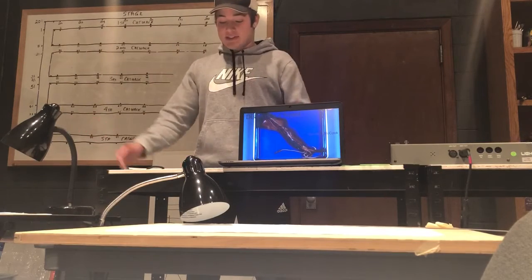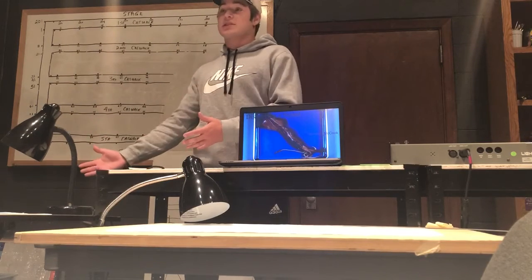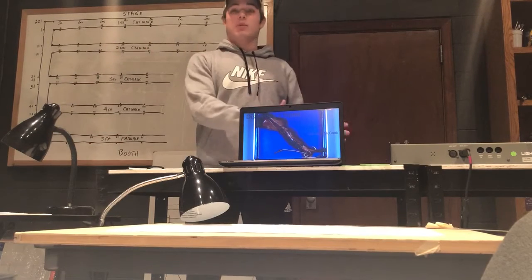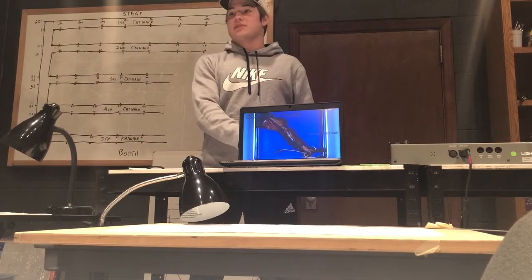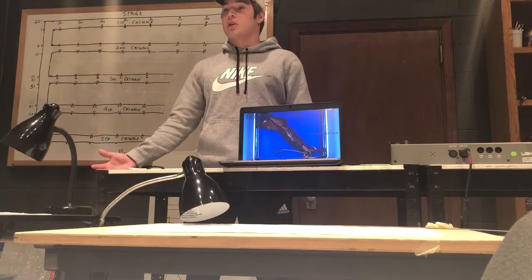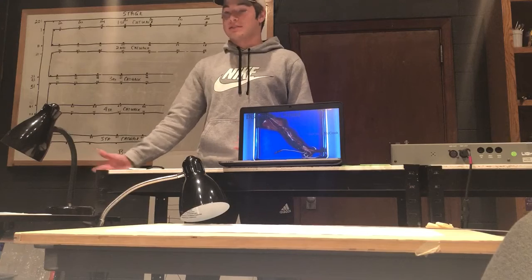Alright, so today I will be showing you the safety procedures for when you're dissecting, the middle part of actually doing the process of the dissection, and then the cleanup and disposal of your dissected contents.